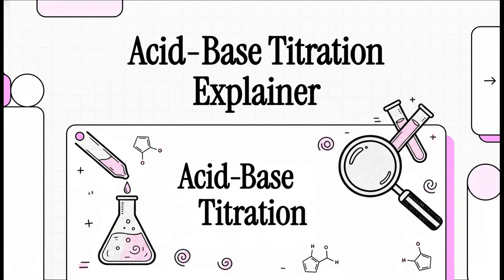Hey everyone! Today, we're putting on our detective hats and diving into the chemistry lab to solve a classic puzzle. We're going to be talking about a technique called acid-base titration. Now, that might sound a little technical, but trust me, it's a super powerful method, and you'd be surprised how much it affects our daily lives.